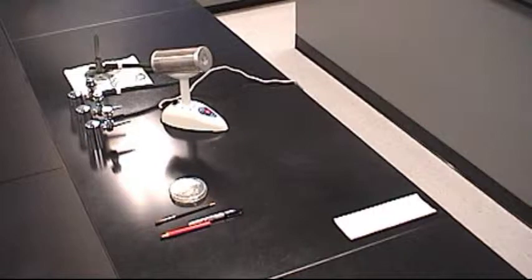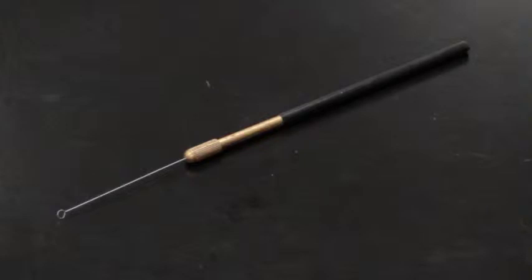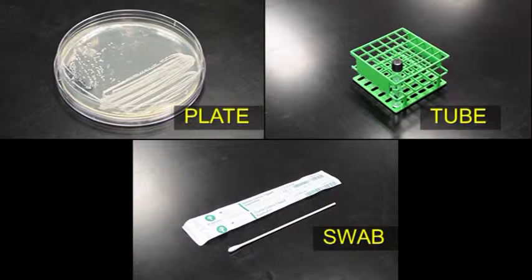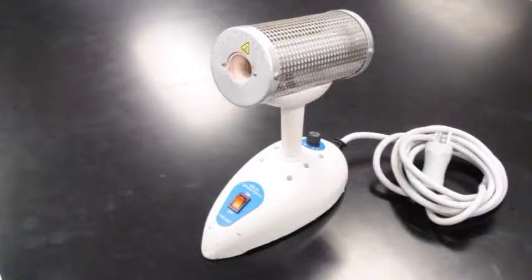To prepare a streak plate, you need a marking pen, inoculation loop, culture in either a plate, tube, or swab, plate with appropriate growth media, and bacterial incinerator.